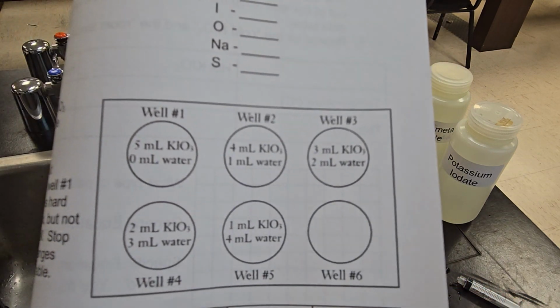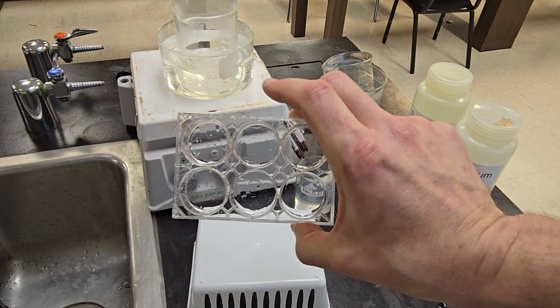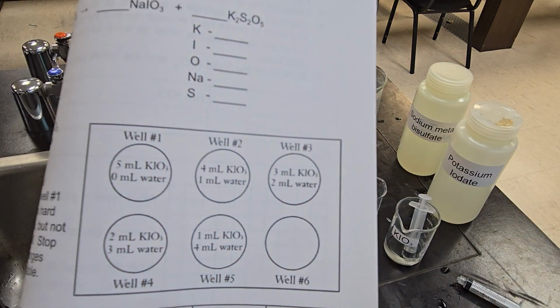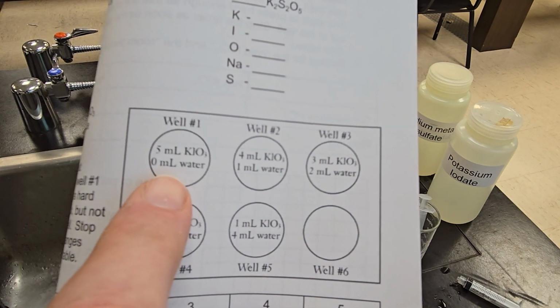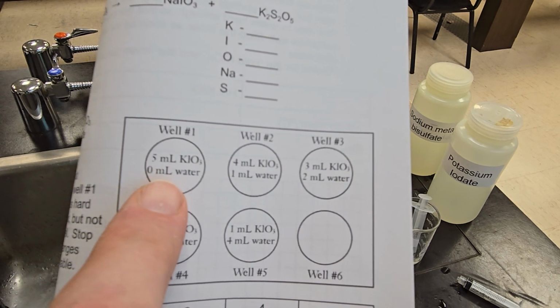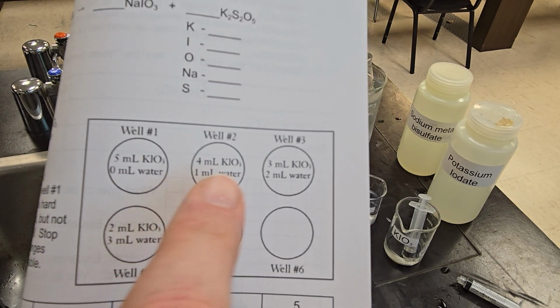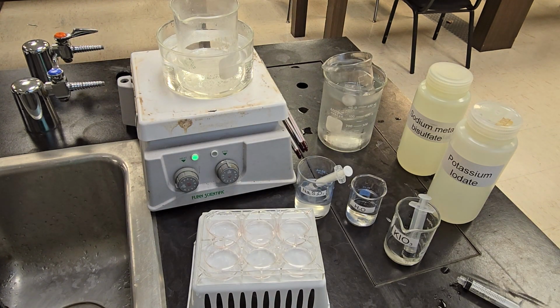As you can see, we need to set up our well plate. That is this right here, our well plate. With these concentrations, we will change the concentration of potassium iodate. First well will have 5 milliliters of potassium iodate, 0 water. Then 4 to 1, then 3 to 2, 2 to 3, 1 to 4.